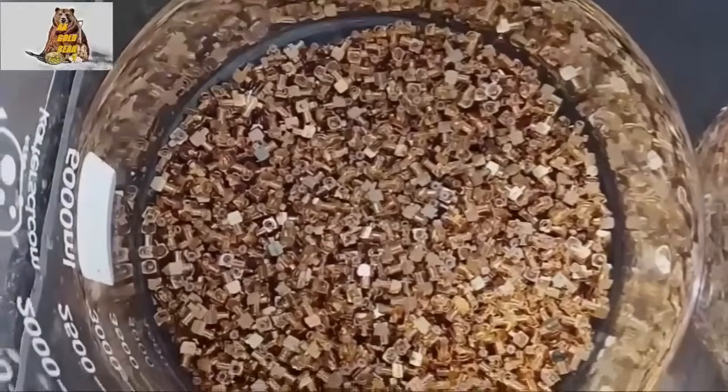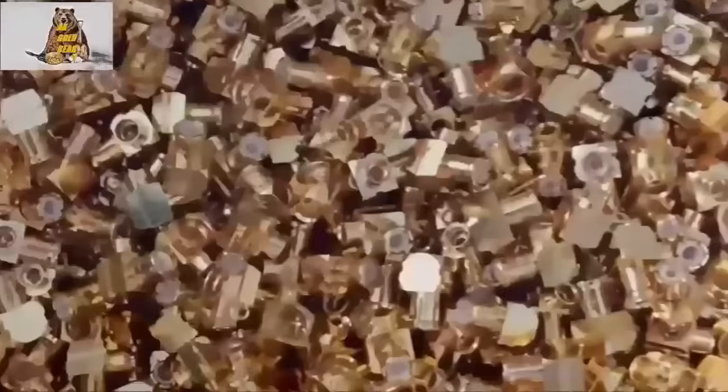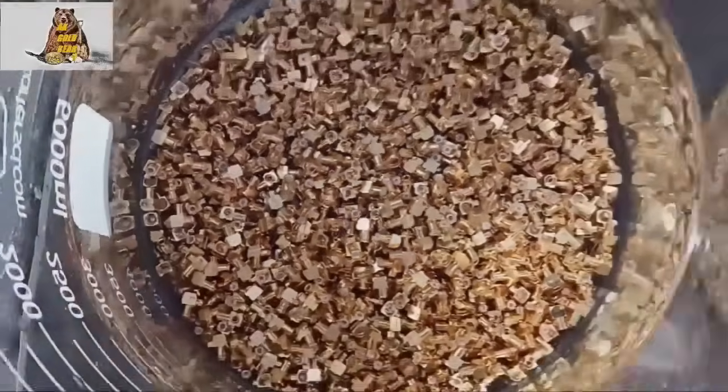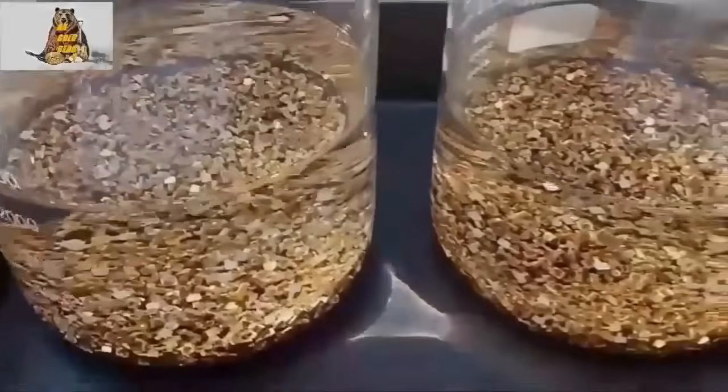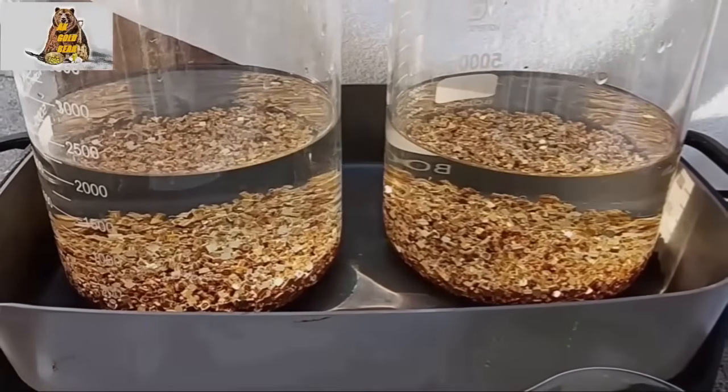Just like in my last video. And I know that I should get 3 grams of gold from them. As I said, I need copper sulfate, and I will get gold as a small bonus.